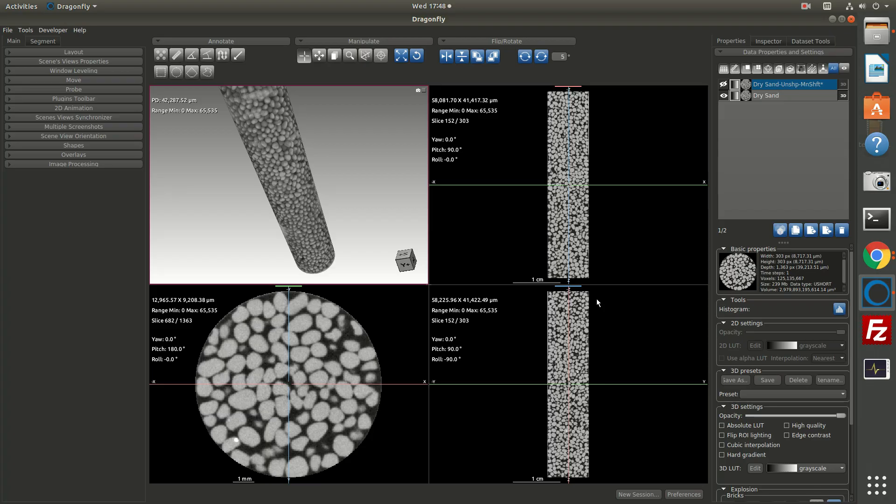In this demo, we're going to use the dry sand pack from the Digital Rocks portal to look at some segmentation tools. We're going to use the watershed transform and the distance map to do some grain separation.